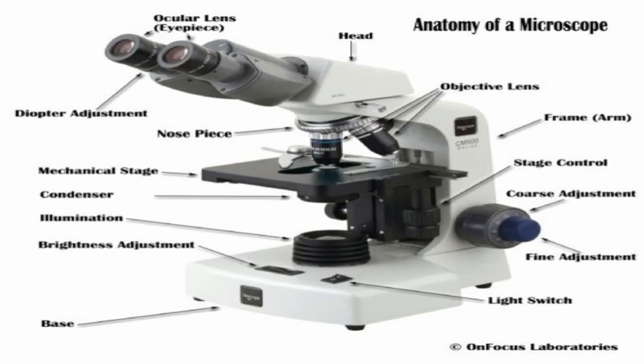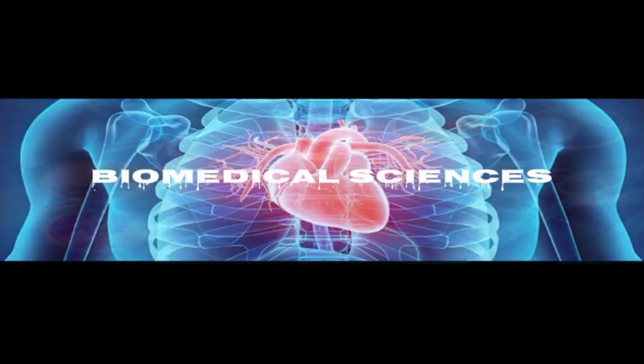The microscope has a head, the eyepiece that we look through to see those specimens that need to be viewed.